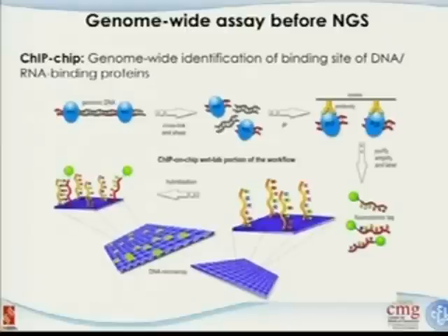Okay, so what goes on here is you have this double-strand DNA, okay? You have a protein binding on it. This is a POI, which stands for the protein of interest. And your goal is to identify, genome-wide, where this protein binds. The first stage of the experiment is the so-called cross-linking. Cross-linking means that if this protein binds on the DNA, you make it keep binding there. Okay, don't separate. Then at this stage, you shear the DNA, meaning you break the DNA into smaller pieces. The next step is immunoprecipitation, meaning that you can use an antibody or another type of affinity-based assay to capture the protein you want to study. Okay? So it's trapped here and captured in this matrix, but everything else will be floating around.